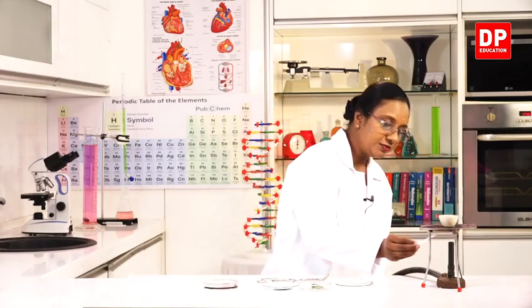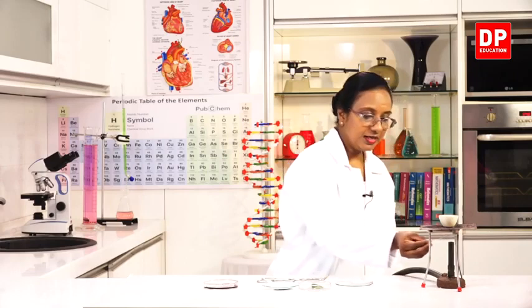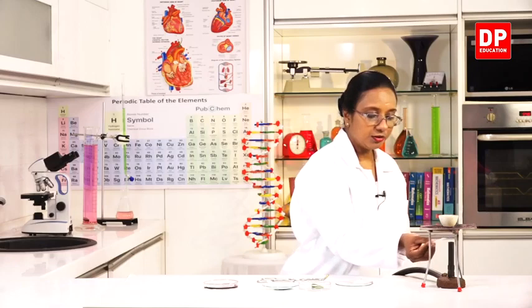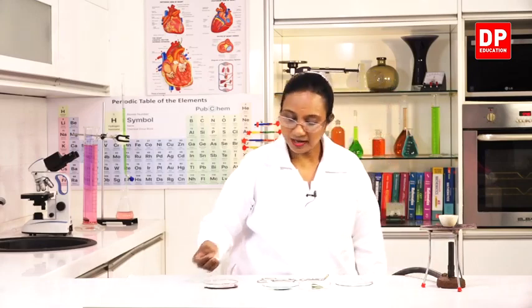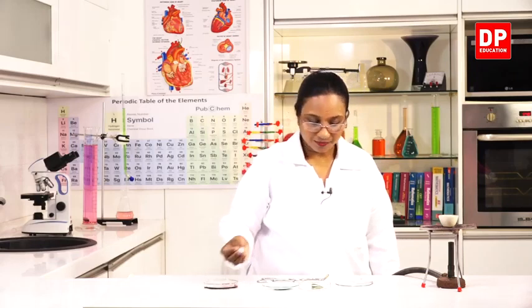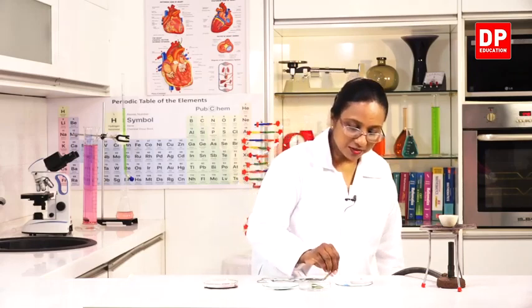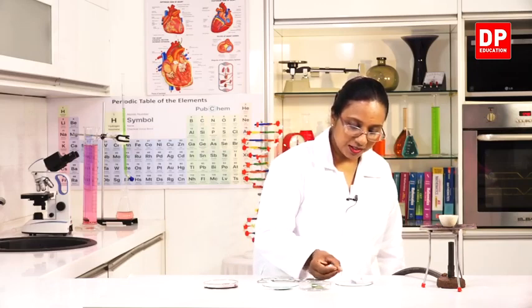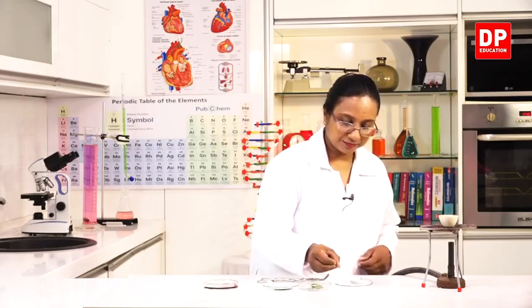When I hold it to the flame, you can see the pink colored cobalt chloride becomes blue in color. If I touch it on the drops of liquid, again you can see it changes color.